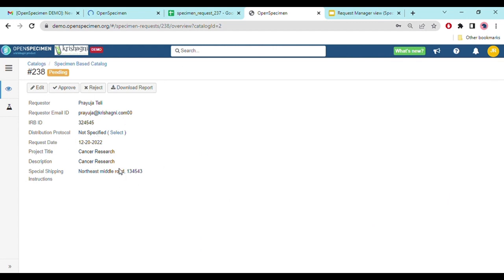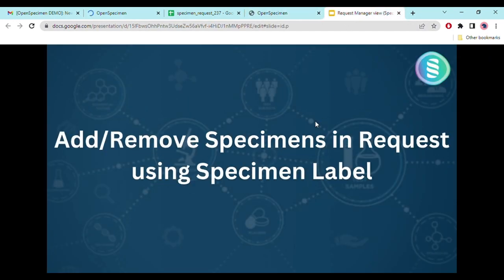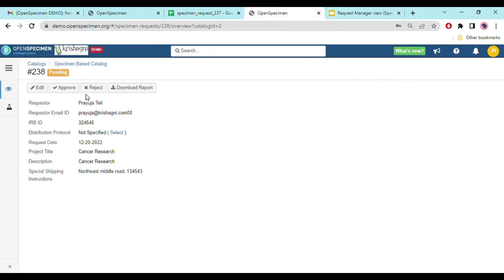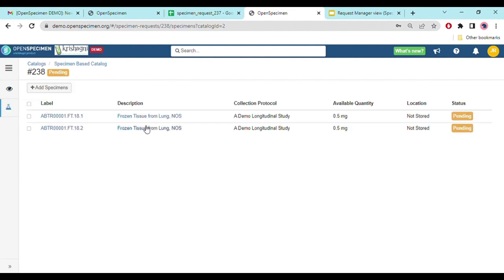This is how the request page looks. You can perform different actions based on the requirement — whether you want to approve or reject the request. Before moving further to approve or reject, I'd like to show how to add and remove specimens using specimen labels and specimen label barcodes. For example, if a researcher has put a request for frozen tissue samples but a specimen is no longer available in the inventory, you can replace it with another specimen that satisfies the same conditions.